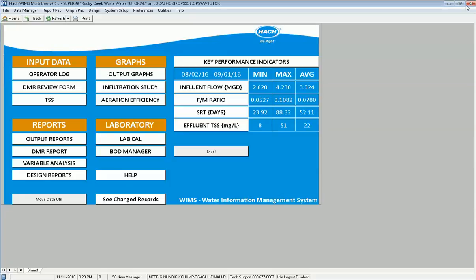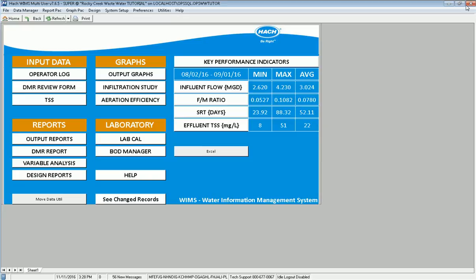In this video, I'll be introducing LabCal, which is an add-on module to WIMS. It is integrated into WIMS and allows you to do simple sample scheduling and sample tracking. In a way, it's a mini-LIMS, but it doesn't have all the features of a full-blown LIMS.